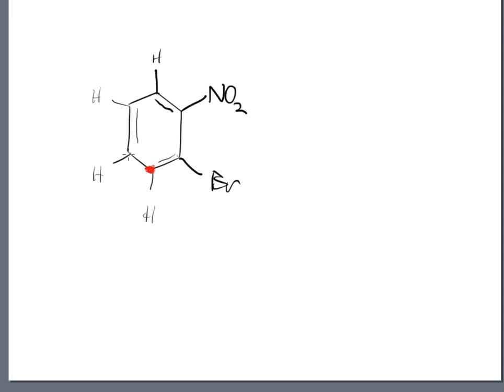Next one over, this is another carbon with a hydrogen, and guess what? That's another ding dong. So we get something there as well. And the reason is because it is different. It's 2 away from the bromine, not 1 away from the bromine, and that is a different position. So that's not equivalent to our first ding dong that we did. All right, next up, we are now 3 away from the bromine, and that means ding dong. We can get something there as well.